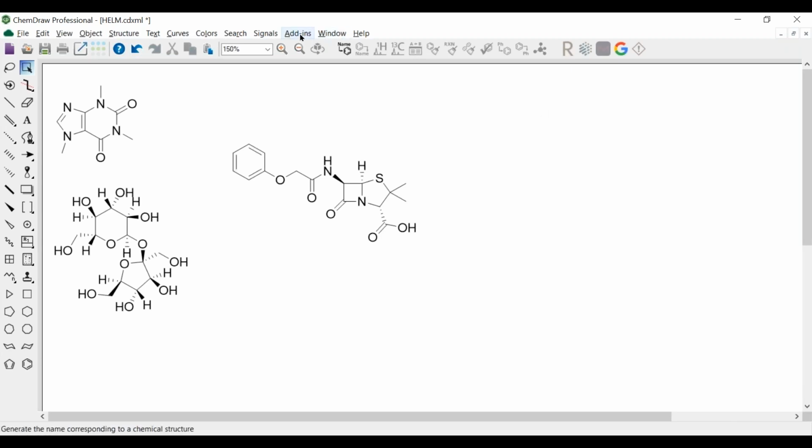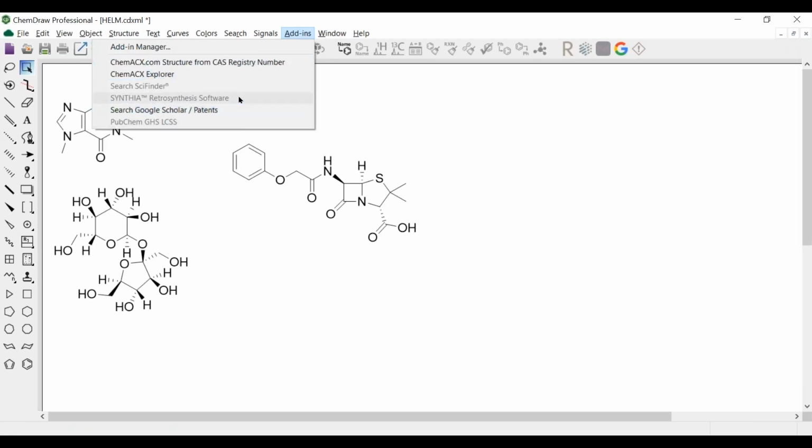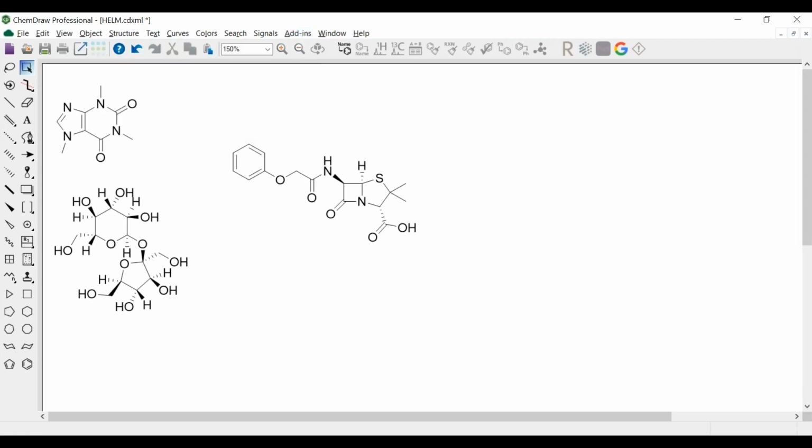You can actually leverage the REST APIs in ChemDraw and build an add-in that'll put another line here that leads to your internal registration or your inventory, so that you can call something in via a barcode or something like that. But it just gives you a lot of power to be able to build out a connector to another system besides the ones that we have discovered are very popular and that people want to have.